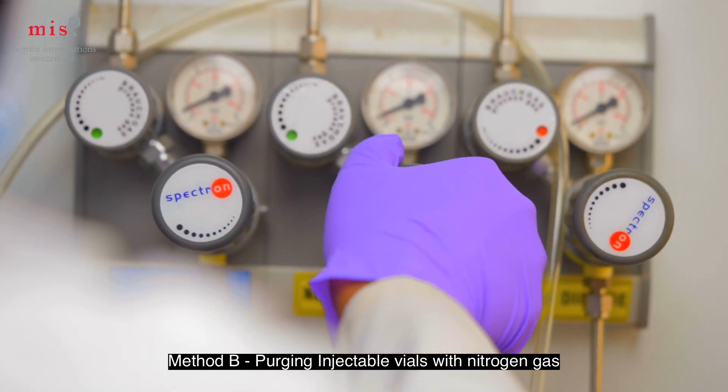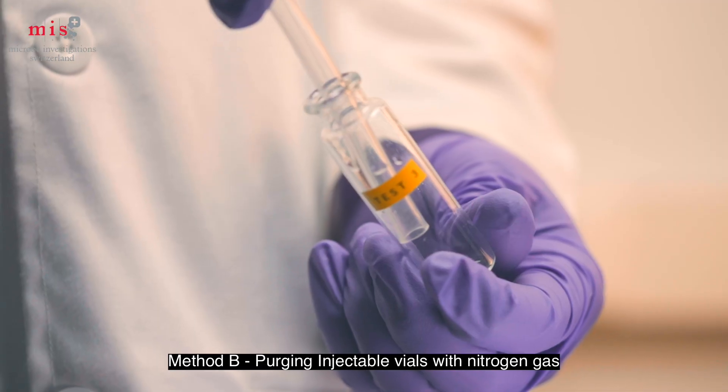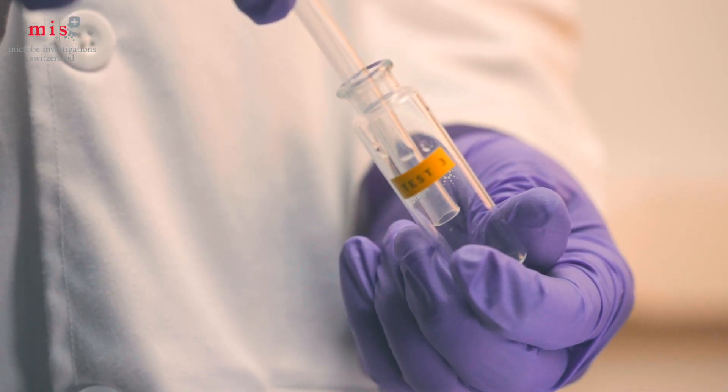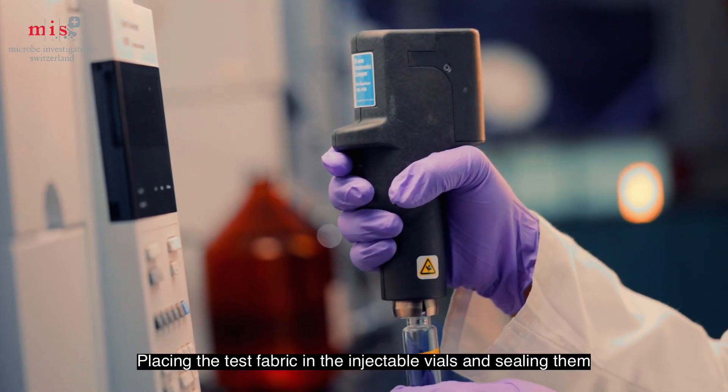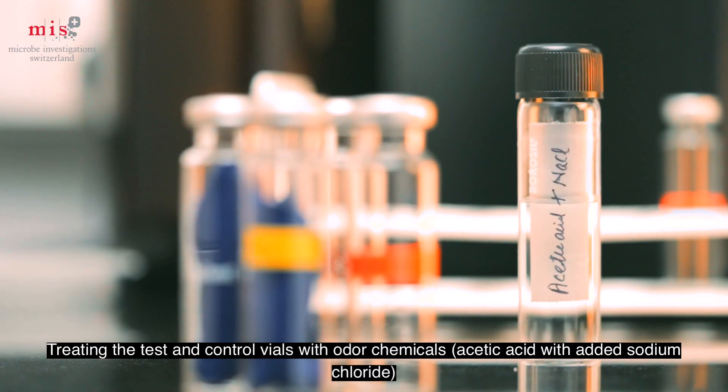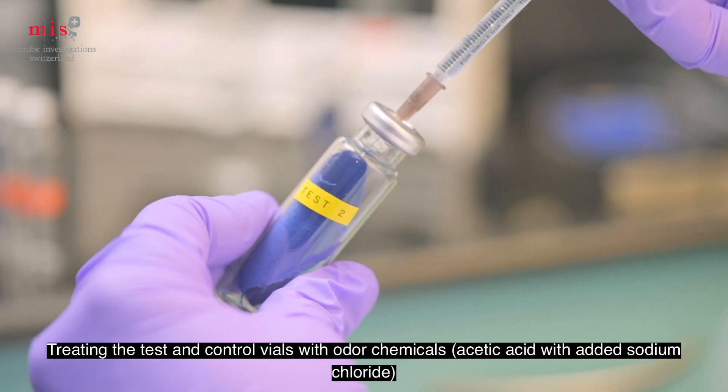Like Method A, Method B starts by purging the air of the injectable vials by blowing nitrogen gas. Test specimens are placed into an injectable vial which is then clamped. The next step involves injecting the odor chemicals into the test and control vials.